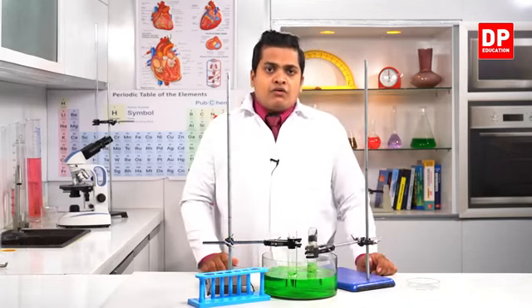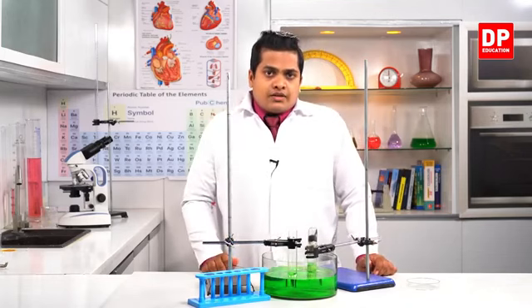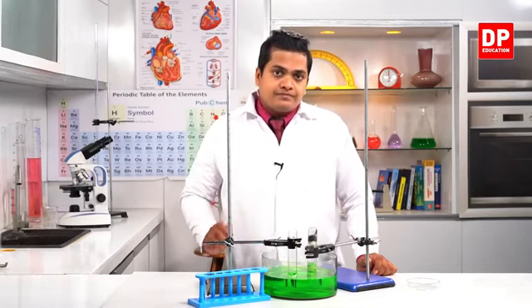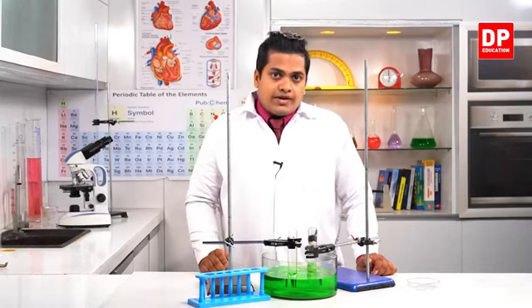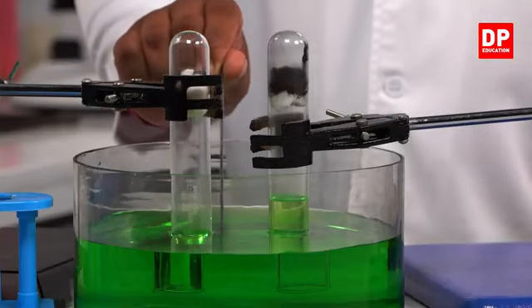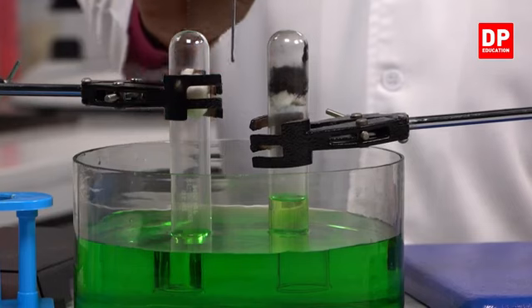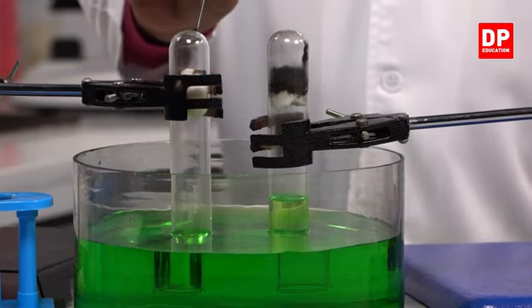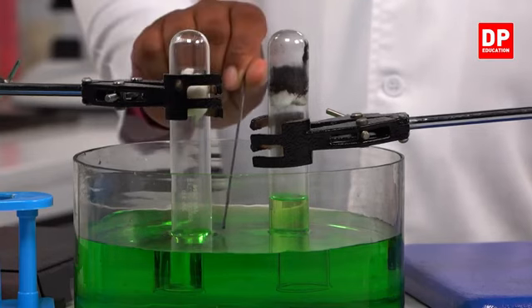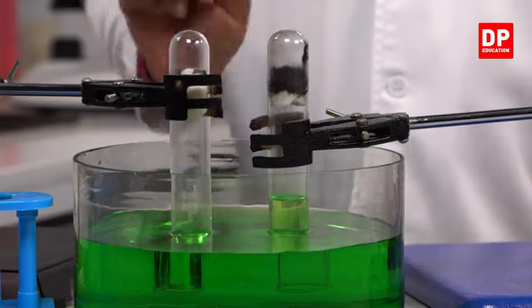Roughly there are about 5 parts in the entire volume, from this water level to the top of the boiling tube.